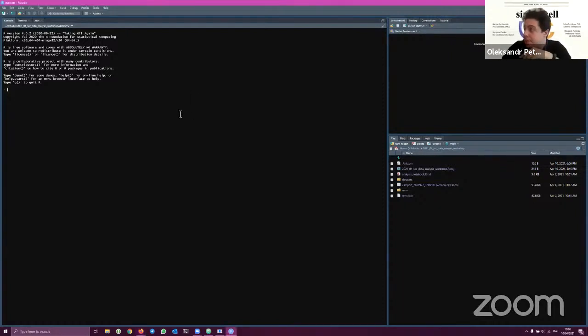And copy paste. What is important is that in the files section to the right below, you see this project file, which is .Rproj. So this is your project file in the same folder with the datasets folder. And if you open datasets, you will see the hepatocellular carcinoma folder here and healthy folders here. If it works like that, then everything works fine.